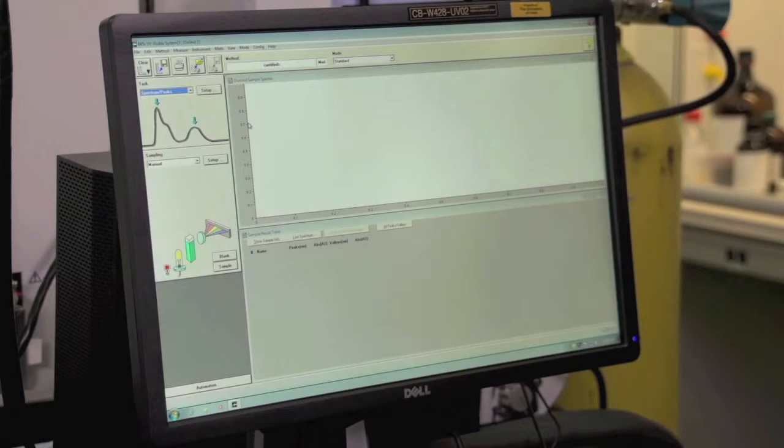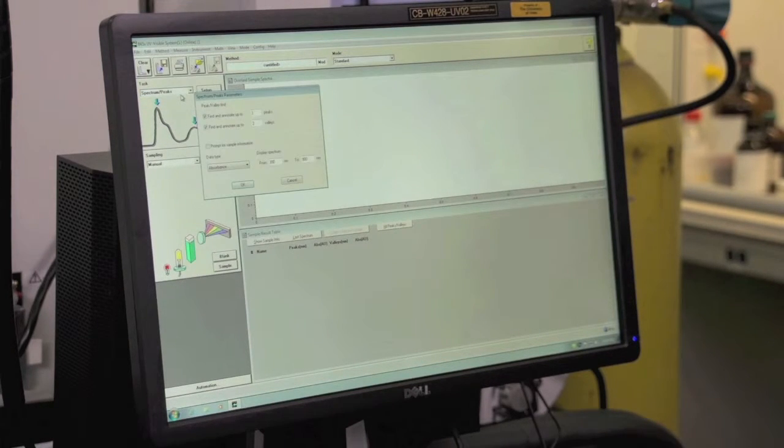Now we're ready to take the spectrum. Before collecting the background, we'll need to make sure that the software is set up properly. Go to methods, then check spectrum peaks, then go to method again and check setup analysis. We'll need to make sure that we have three peaks, but uncheck the three valleys section, and then make sure that the spectrum is displaying from 300 nanometers to 900 nanometers. Then select OK.